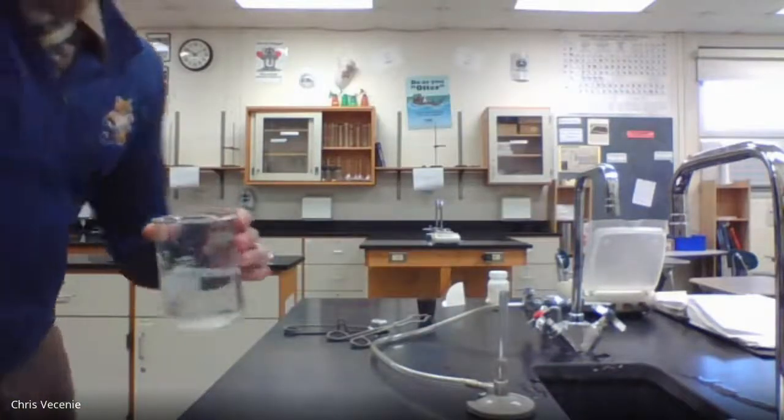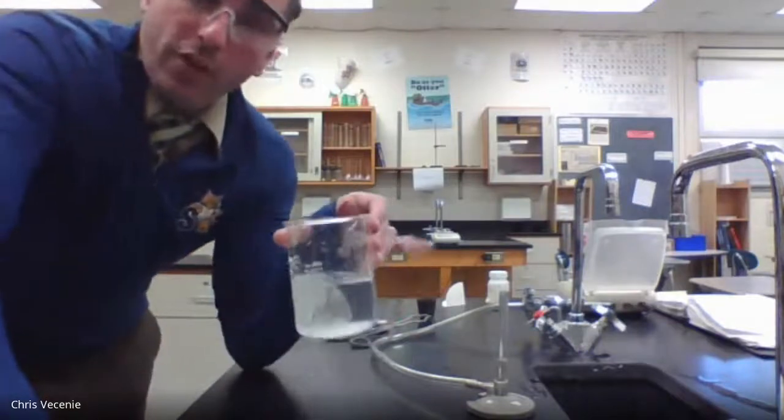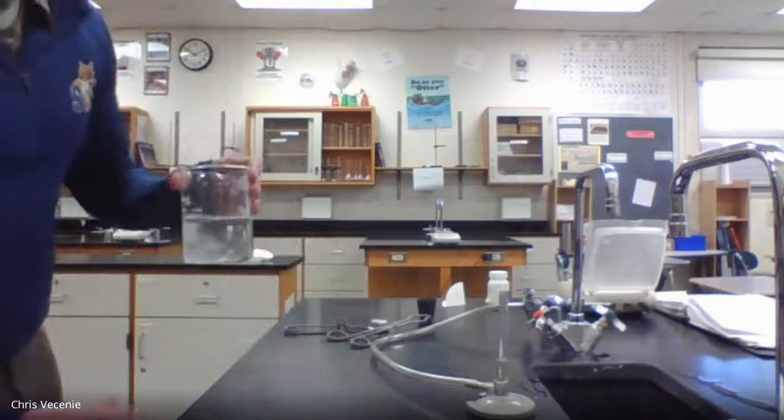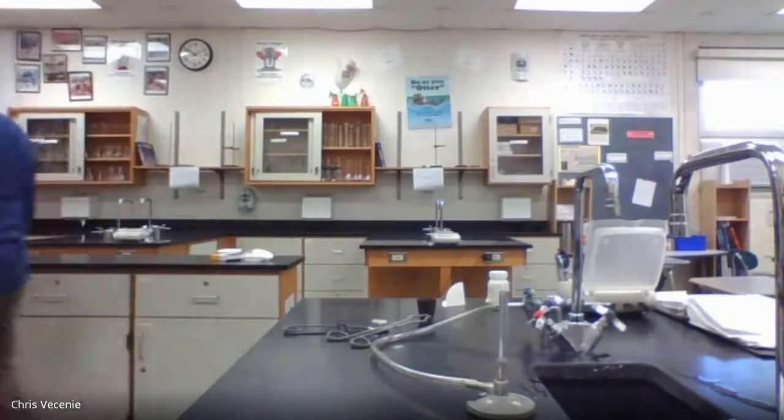All right, but I'm going to just speed that up by doing it in the back with a hot plate with a stir rod on, like you guys did for your lab. All right, so give me a second to go do that.